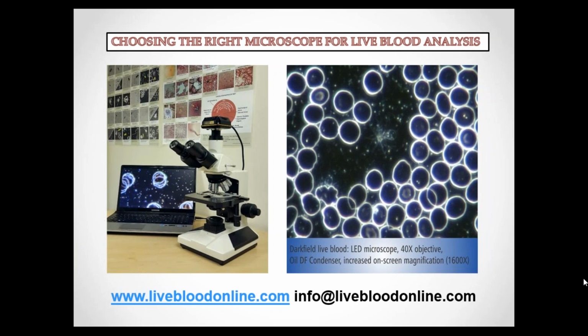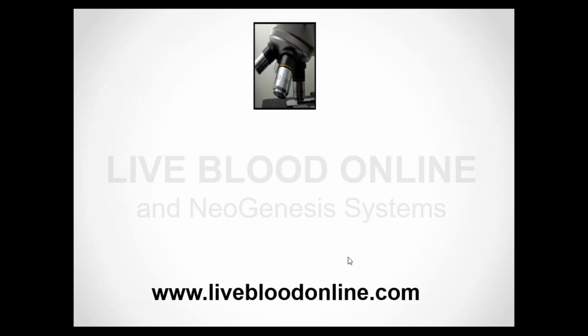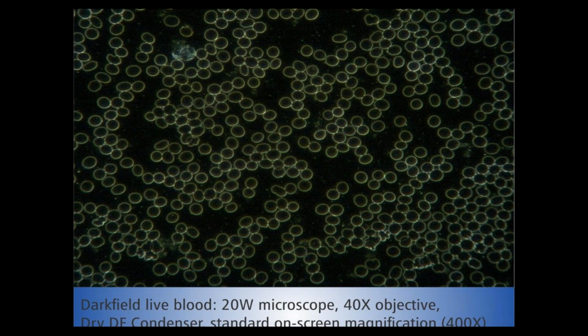Yes, that is one of the questions that we'd like to address with this webinar. I'm sure you'll agree that it's very important to have a suitable microscope system, because if you don't, then you simply won't be able to see what you should be able to see in the blood. The risk is that with a cheaper system, you may end up with a dark field image that looks like this following image. Okay, so with one of the cheaper systems, you would tend to have a dark field image that looks like this, whereas it really should look like this next image.